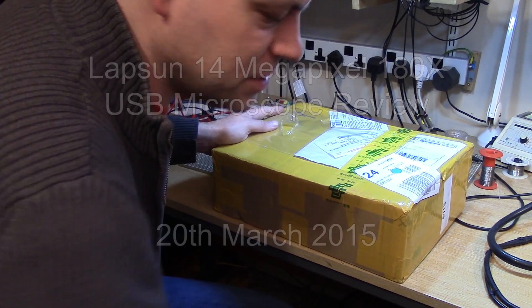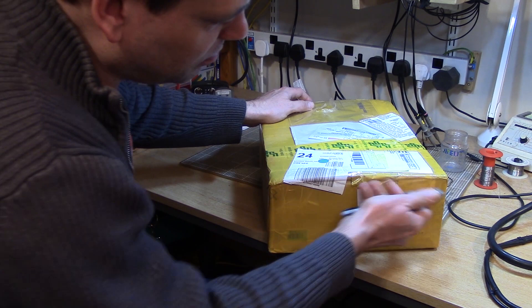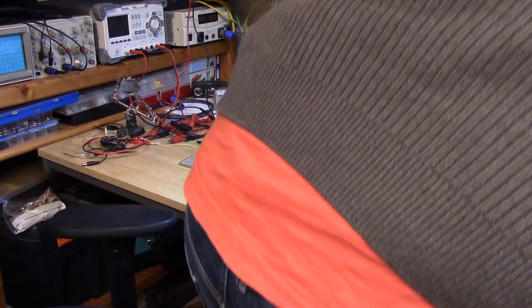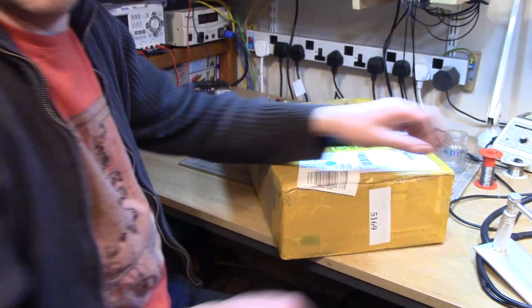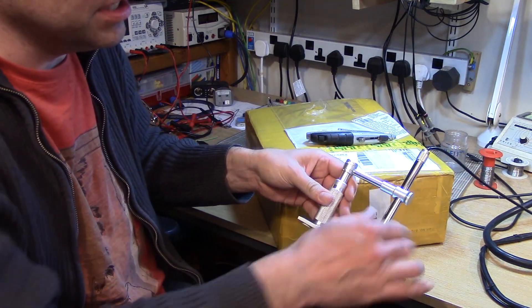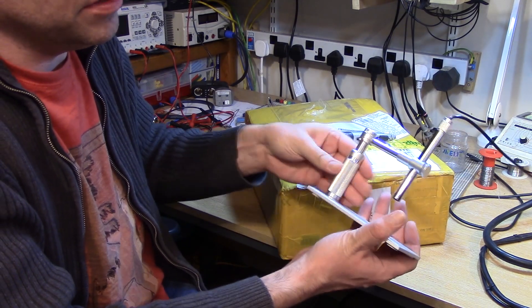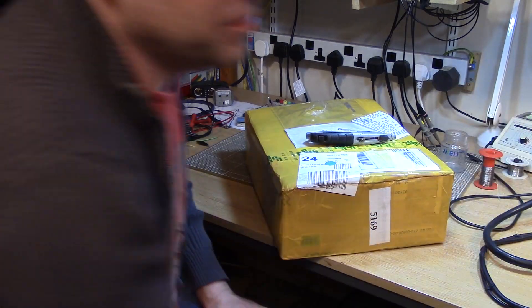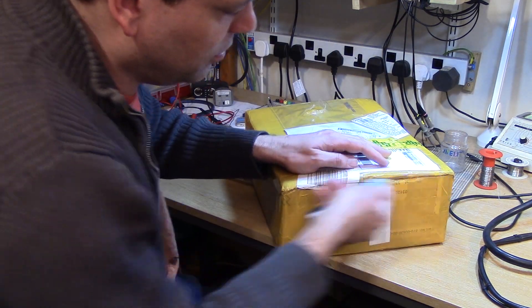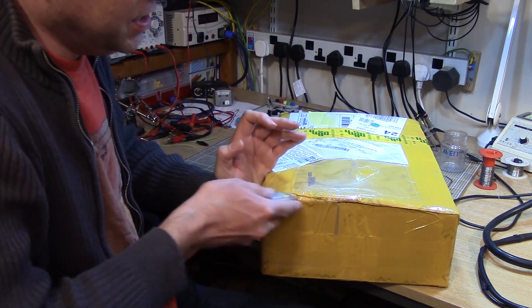So in this box there should be a new USB microscope, and it should be significantly better than my old one. This is what I was using before — this is the Andon Star. It's quite reasonable for money, it was £35 delivered. It's got a little stand that goes up and down, but it's got a very limited frame rate, and if you crank the resolution up to anything worthwhile, it drops down to about five or six frames a second.